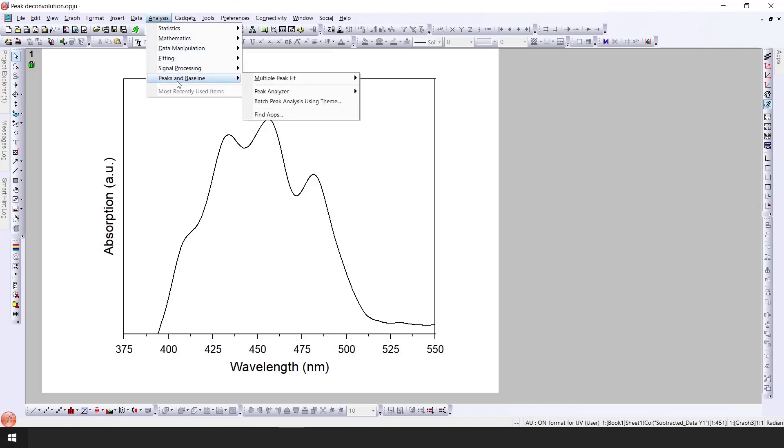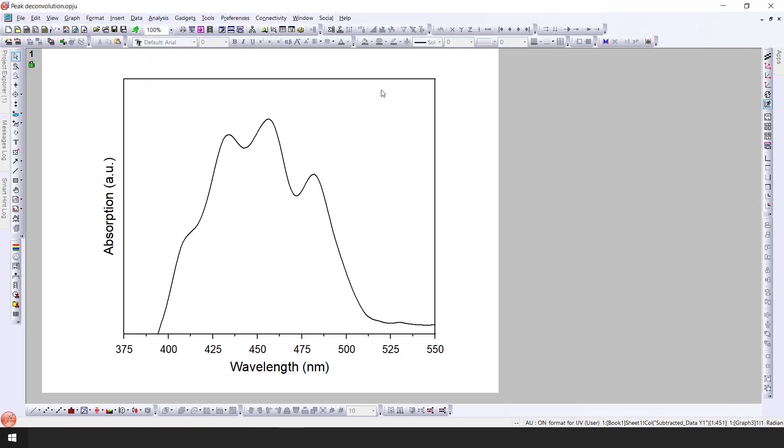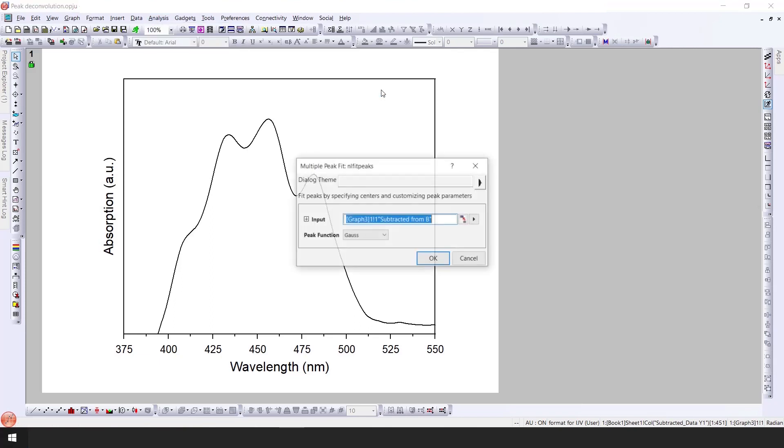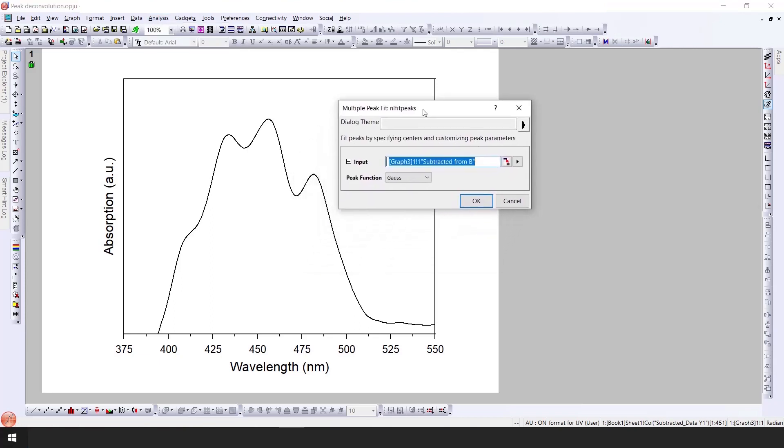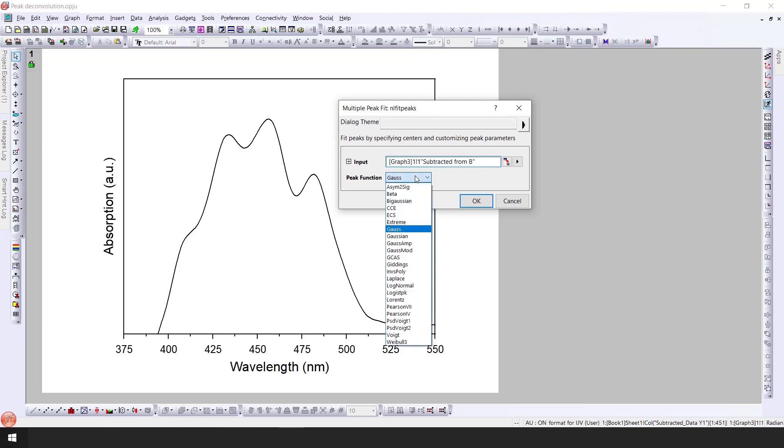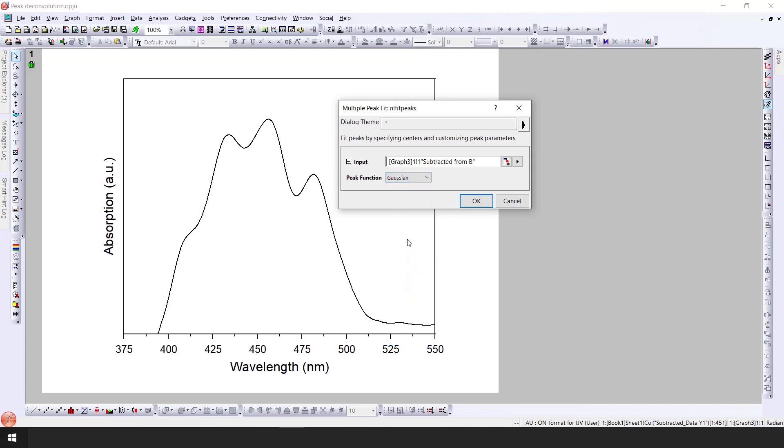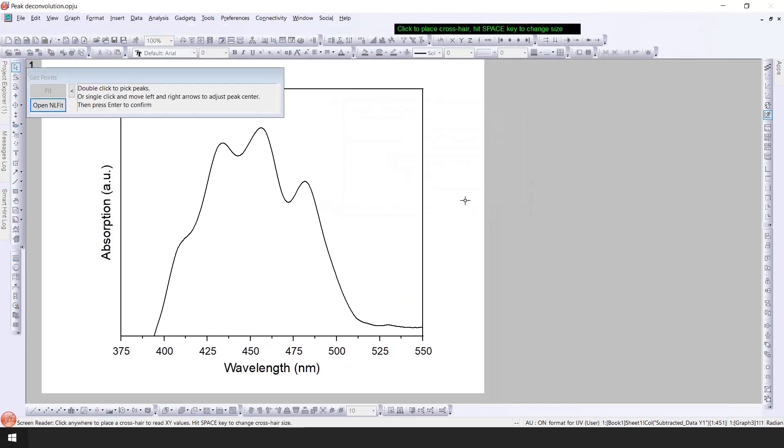Go to the peak and baseline, go to multi-peak fitting, and then click on the open dialog. Here you have different functions that you can use for the deconvolution of the peaks. In this case I am going to use Gaussian. Click on Gaussian and then click OK.